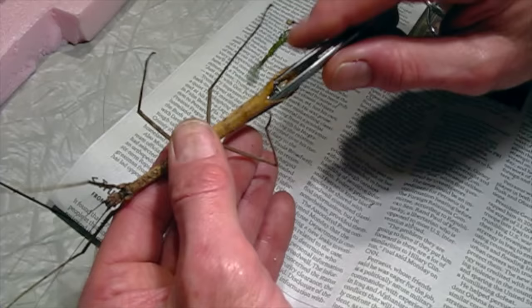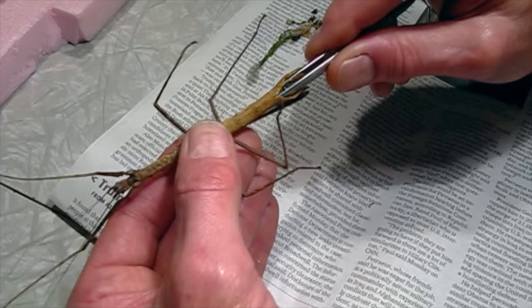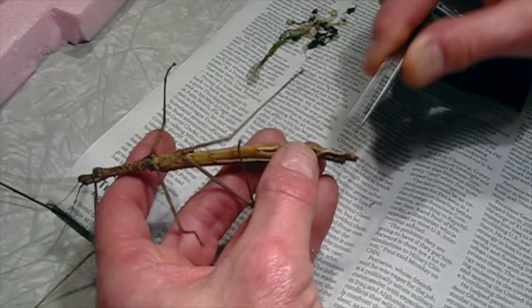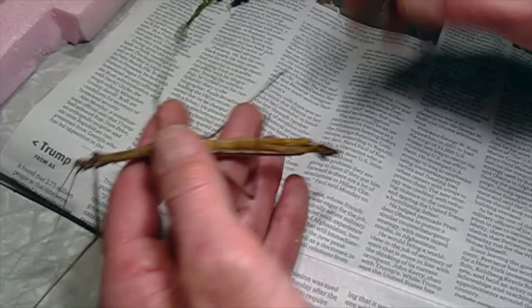With these soft-bodied insects, I always find it helps to give them a quick soak in acetone. It seems to firm up the flexible, thin exoskeleton — it kind of stiffens it — and it kills off the bacteria and stuff that would make it rot more quickly. So I'm going to give this a quick acetone soak.